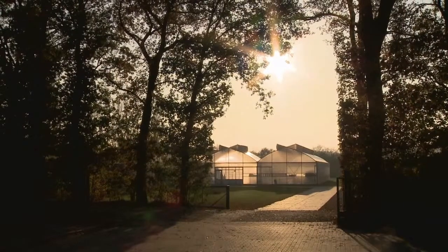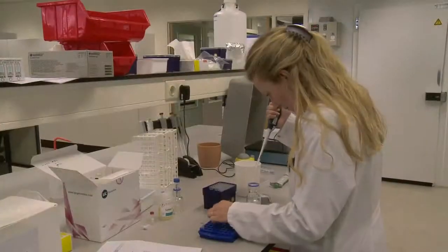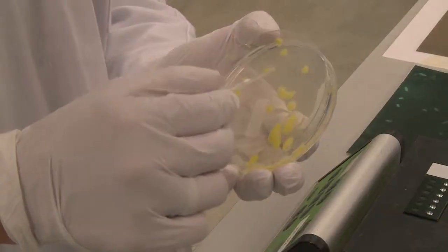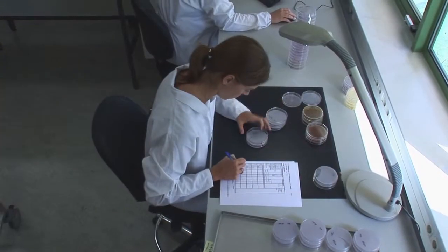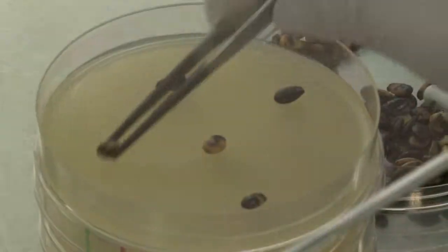Apart from performing various tests, Naktuinbouw continually improves existing testing methods and develops new ones. They also ensure that new and often expensive scientific tests and developments are translated into reliable and affordable tests, which can be applied on a large scale. As a result, Naktuinbouw hereby contributes to high quality and healthy horticultural propagation material.